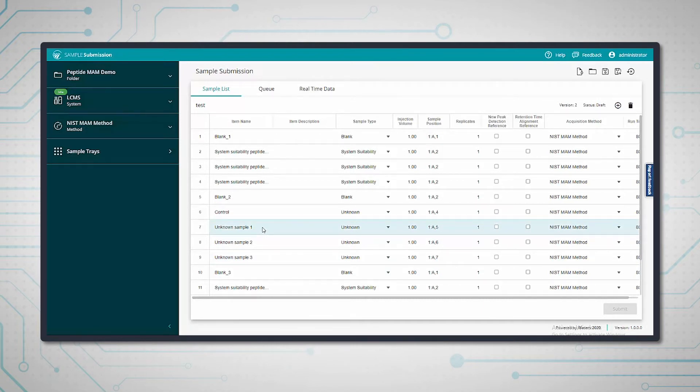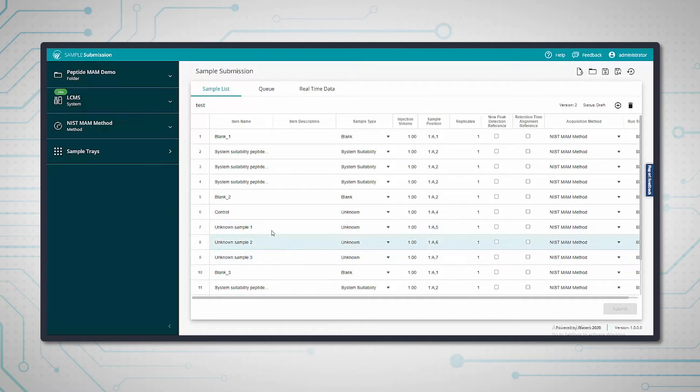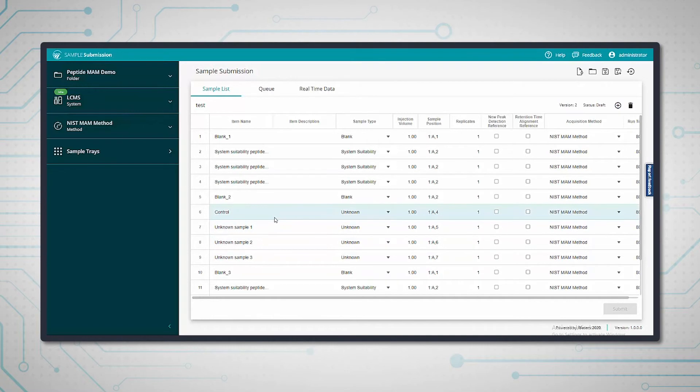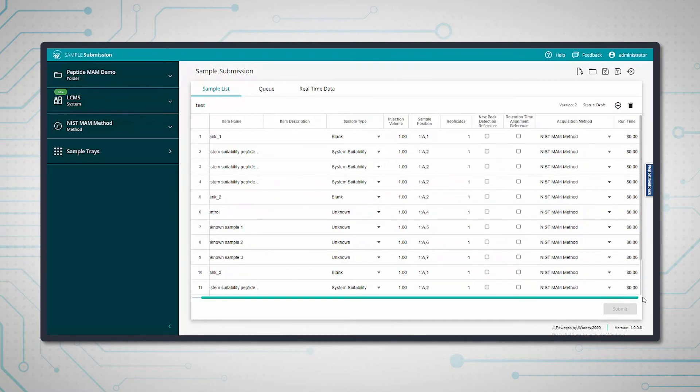The unknown samples are all NIST tryptic digests. The control is a standard tryptic digest, and we have some different conditions including some stress conditions, so we can compare these using the peptide mam workflow.